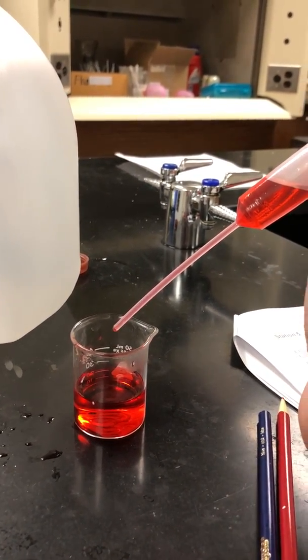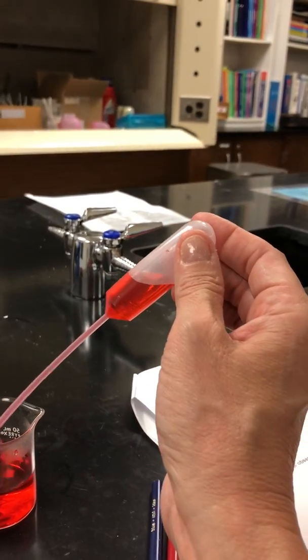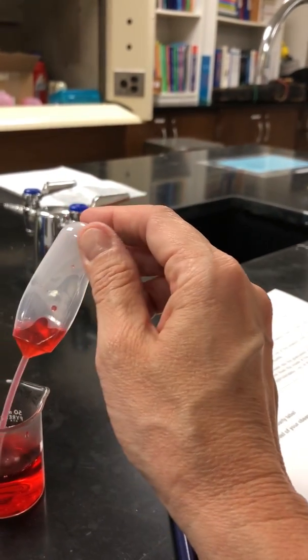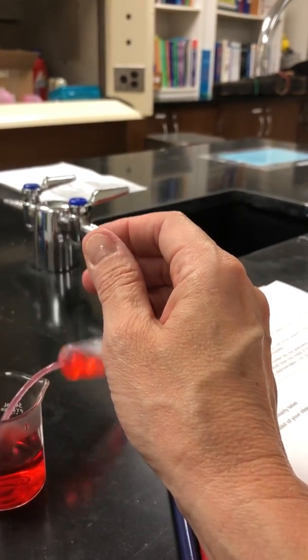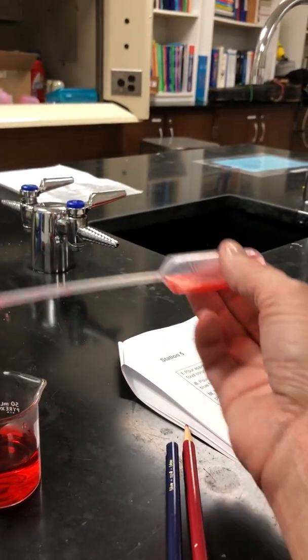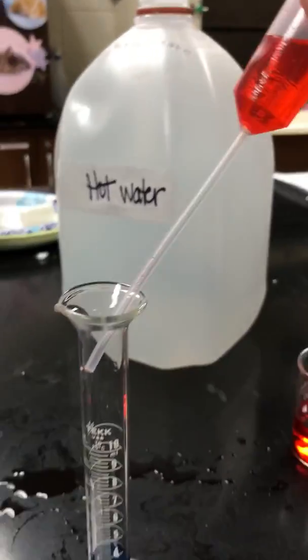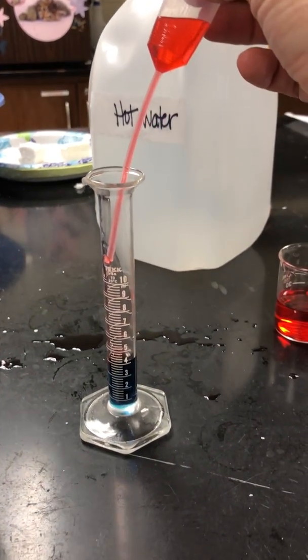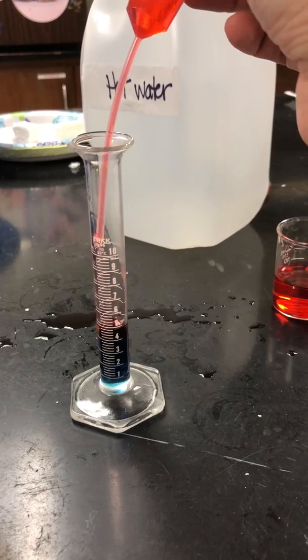You're gonna learn about this in gas laws. So there's some gas in that pipette. And you're gonna learn that when temperature goes up, so does pressure. And so the pressure of that gas is going up, and it's actually wanting to push it out of this pipette. So let me get it over here. There we go. Okay, sorry, buddy. I heated you up too much. But it's gonna make this super, super easy.